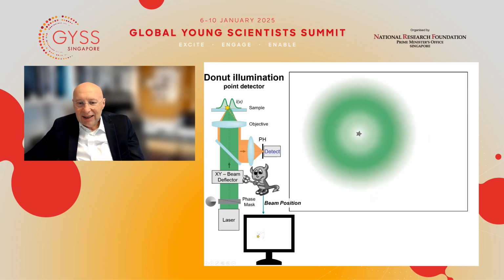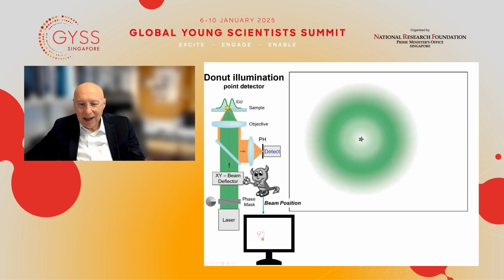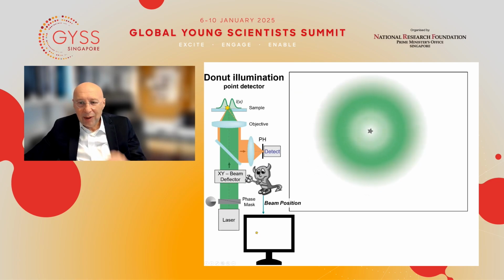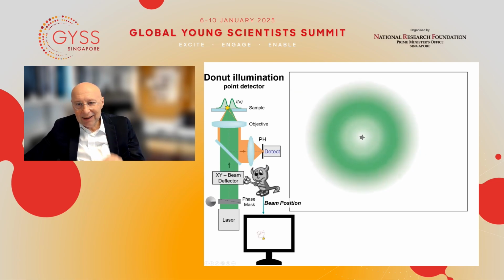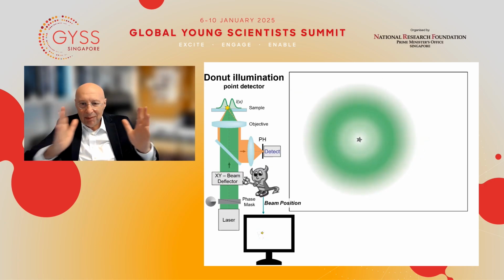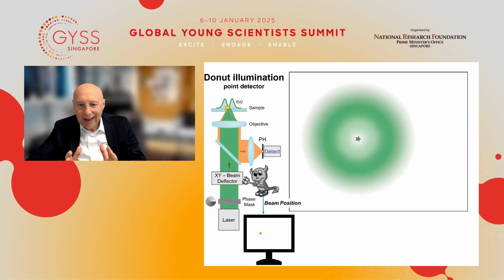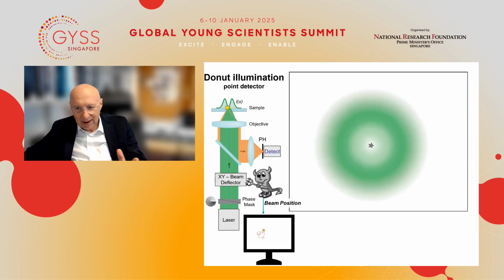Why? Because the demon knows, oh, there is no emission going on. So the place where I put the donut zero must be the place of the molecule. So the demon can trace all the time the molecule without requiring any single fluorescent photon. Now compare this with what you saw initially. So initially we had a concept that needs to maximize the number of fluorescent photons. But here we have a concept that doesn't require any. So it's the total opposite.